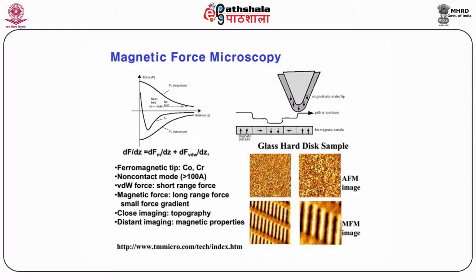All these can be measured with the help of this. These are some of the figures that one obtains by using magnetic force microscopy. So first is the image taken by nanoscope SPM, courtesy data imaging. Then we have overwritten tracks on a textured hard disk which are 25 micron scan.